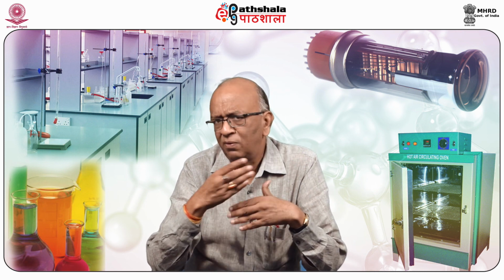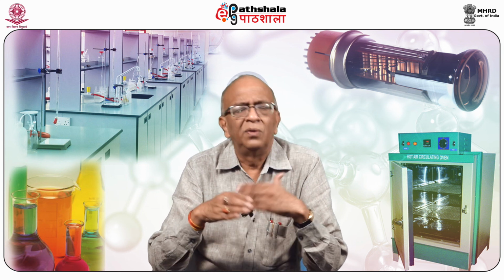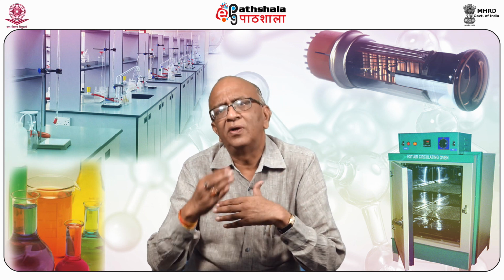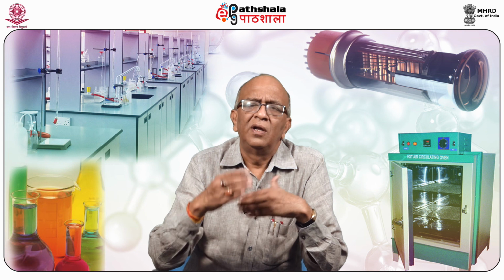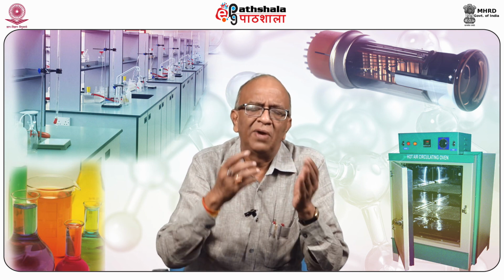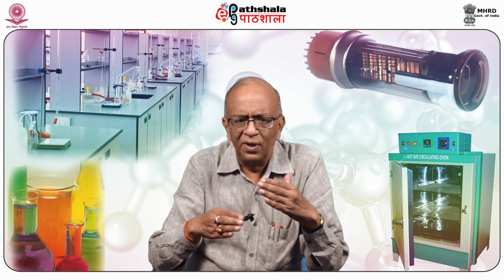By equilibrating and then partitioning, on the basis of their partition coefficient, separation takes place, and you may find spots at different places. By measuring the RF value, you can identify unknown compounds as well as use it for separation.